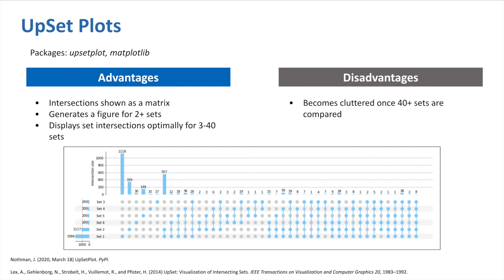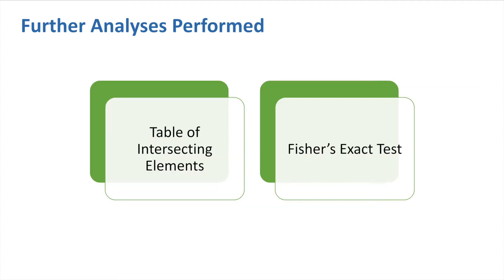In this upset plot, we can see that comparing 6 sets is very clear and informative in contrast to the 5-set Venn diagram we looked at previously. After the user decides which visualizations they would like to use, the Aperture performs further analyses on the intersections by generating a list to display the intersecting elements and sending them to Enrichr, as well as performing Fisher's Exact Test.